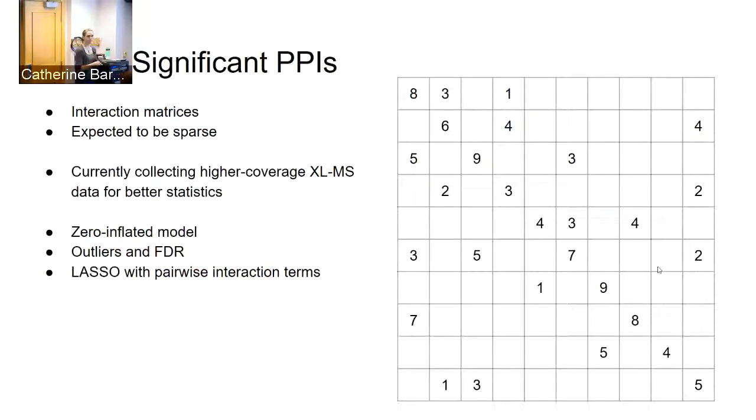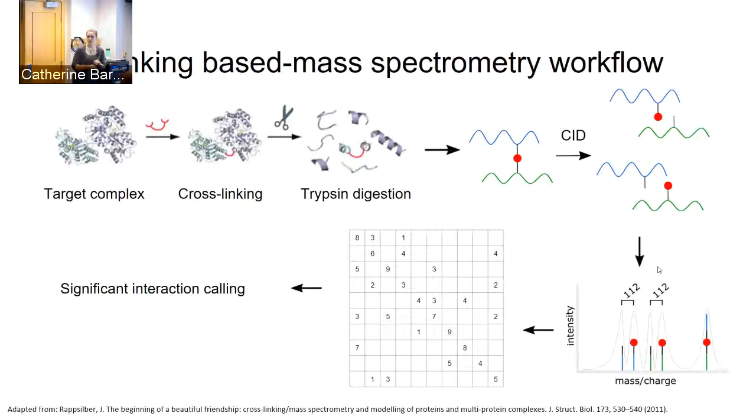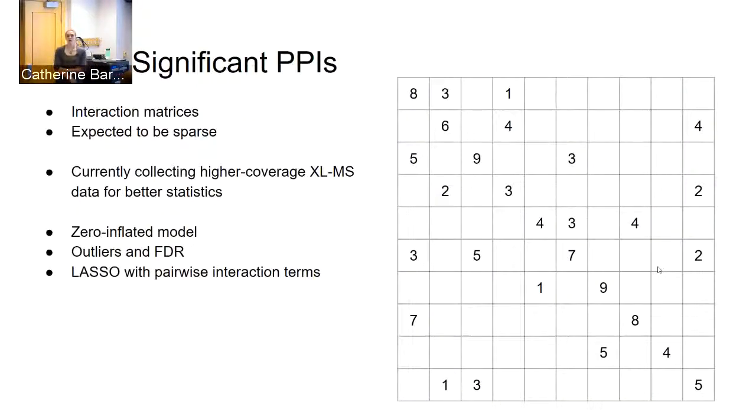Do you detect homodimers, the difference between homodimers and the self-interactions? So it probably would depend on the cross-link distance. For example, one of the ones that I'm going to show later, we are able to detect the difference, but it's just because either within the dimer versus across the dimer to the other side is too far for the cross-link to actually reach. So you can detect it if you have the crystal structure to map back to, but if you have no knowledge about what that quaternary structure looks like, probably not. Unless you built the model yourself, which I'm also going to talk about.